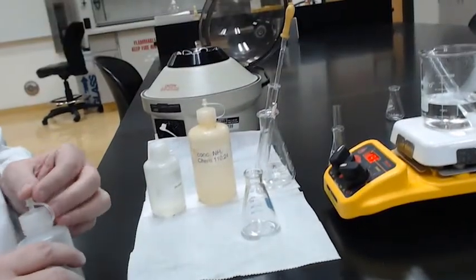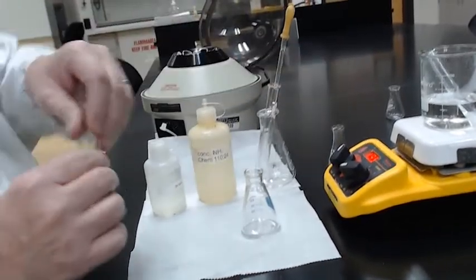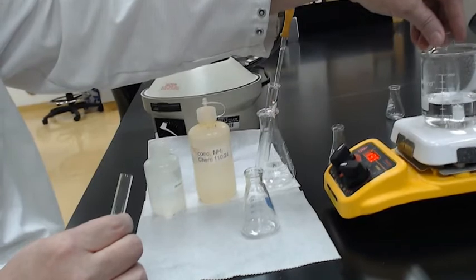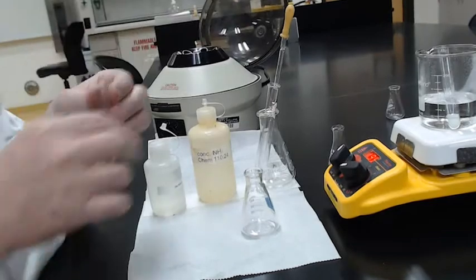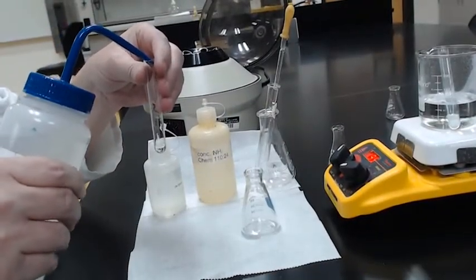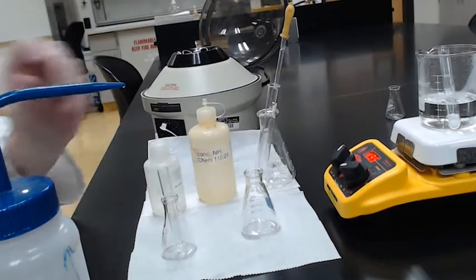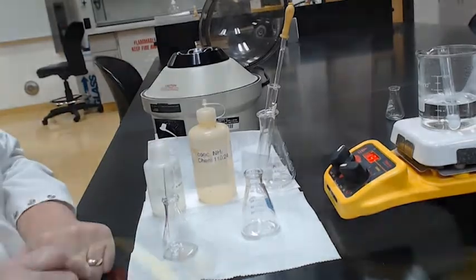So we now have to fast forward 1 minute in time. But while we're doing that, we're going to start preparing a second test tube. Now we're going to centrifuge, and the secret to centrifuging is balance. You want 2 test tubes of equal volumes when you place in the centrifuge, and so this is going to be our balancing test tube. And we'll hold them up and compare them after our minute is up. We still have 30 seconds. And we'll then move to the centrifuge over here.